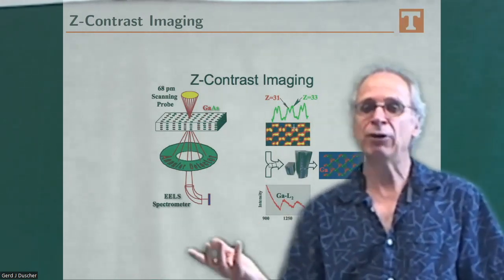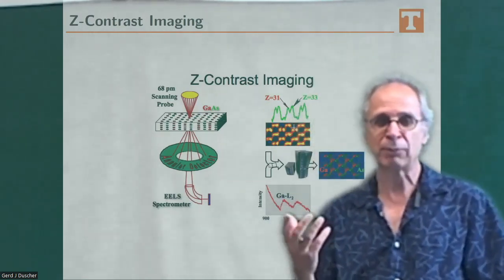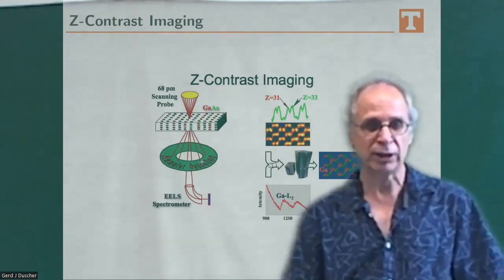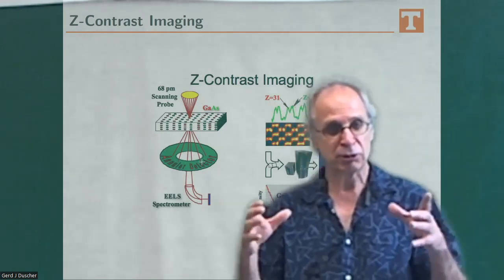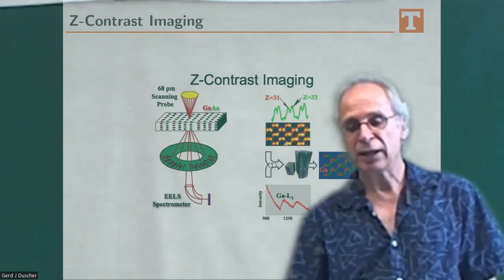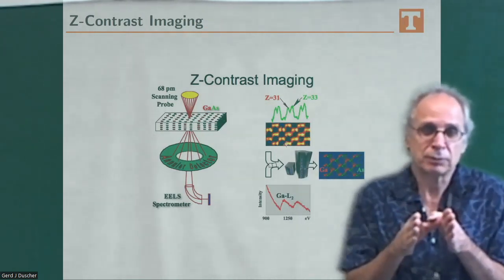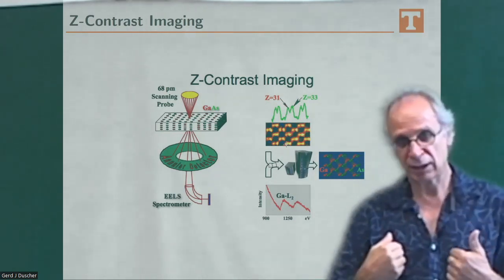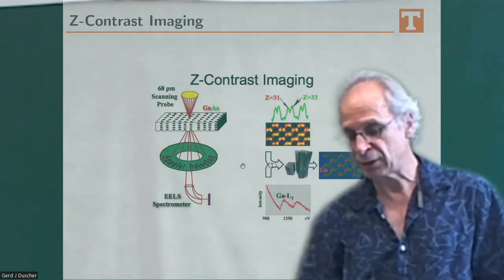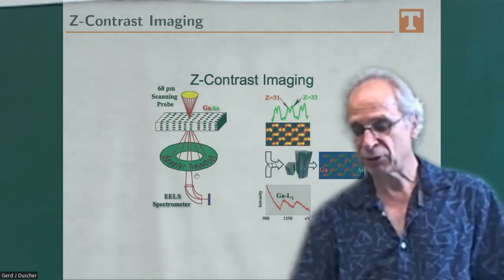Okay, now it depends. The squaredness, how close to atomic number squared is that? That depends on your inner angle. Did you only allow Rutherford scattering? If you reduce that, you have diffraction contrast. So you have problems here. And we also know now that the closer the atoms are, the intensity goes down. And so that might not be linear very easily. The contrast changes with our transfer function.